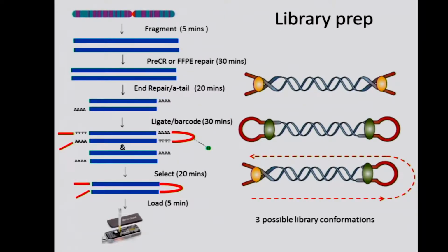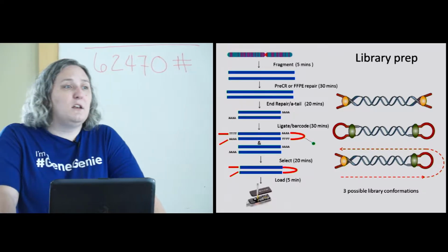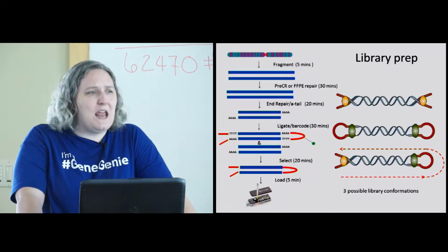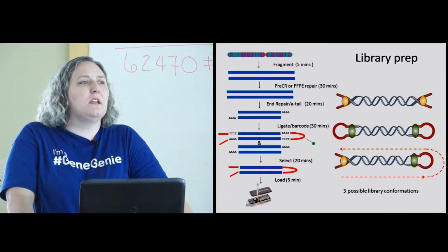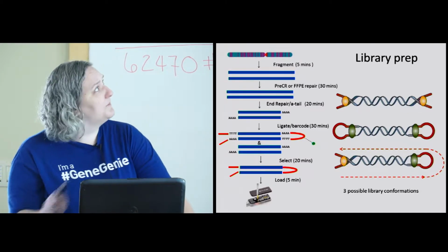So we're going to go through what the library preparation is real quick. Start with your DNA, and you're going to fragment that. Now I use Covaris G-tubes to fragment. Those devices allow me to fragment anywhere from a few thousand to 10,000-plus bases. You can use unfragmented DNA, some people have. One of the problems of using DNA much in excess of 10,000 is it becomes fragile, and you have a much more difficult time properly forming the library and delivering it to the pores themselves.